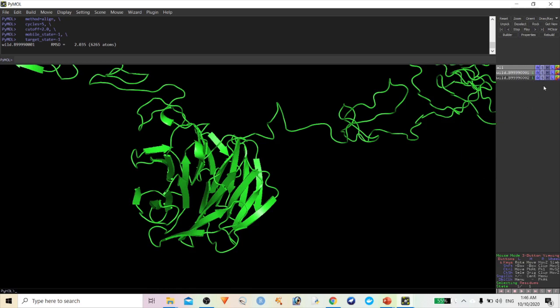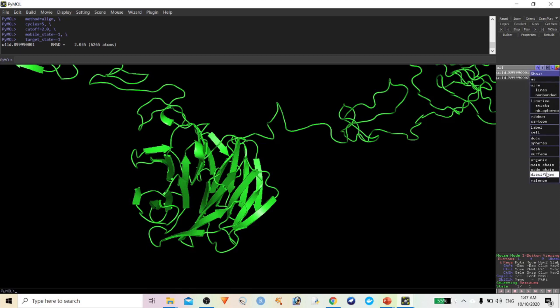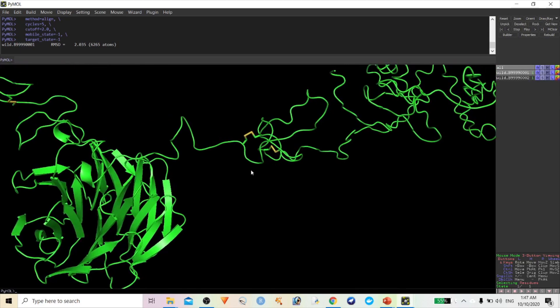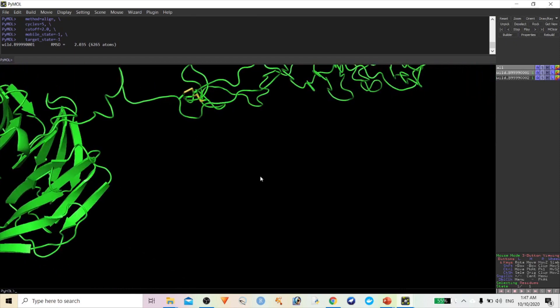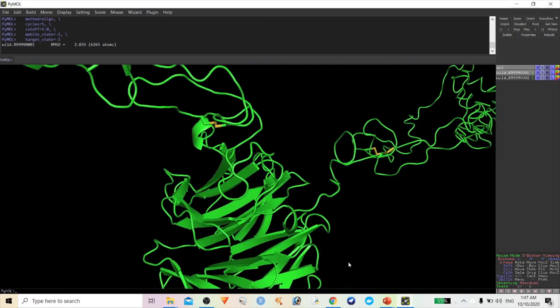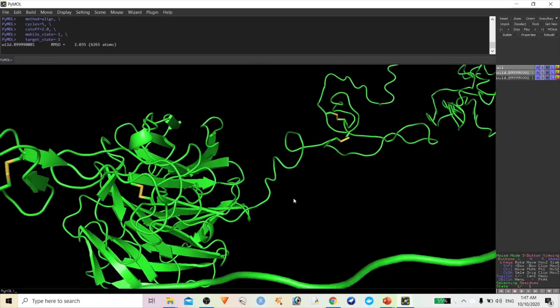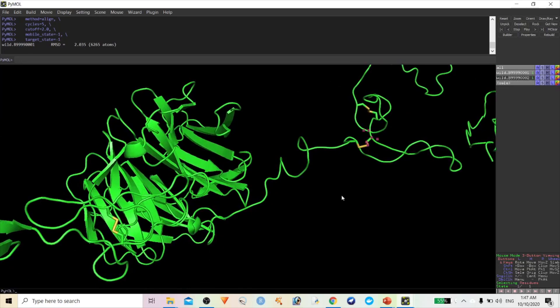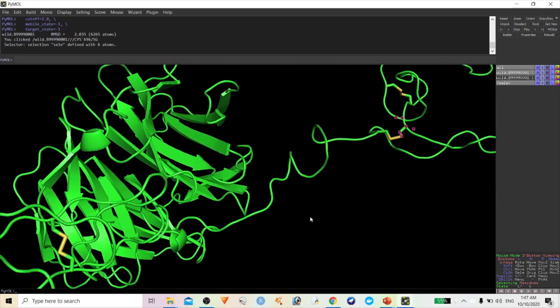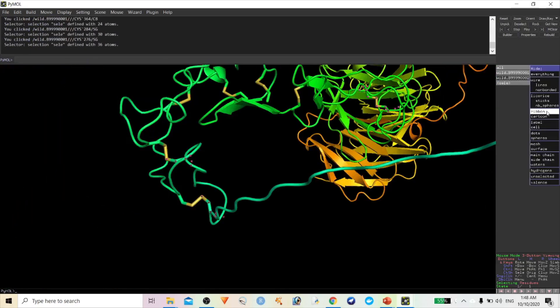If you want to check the salt bridges or disulfide bonds in a protein, click Show, then click Disulfide Bonds and Sticks. You can see the different types of disulfide bond interactions. There are many disulfide bonds in this protein.